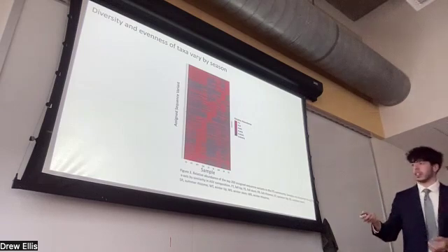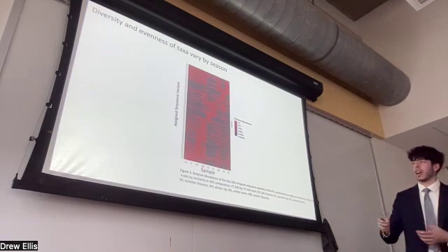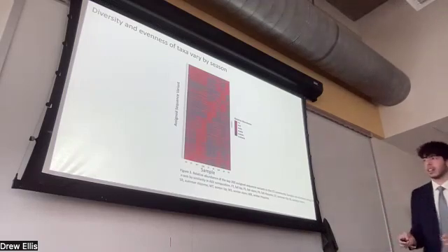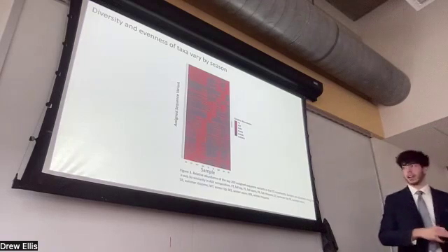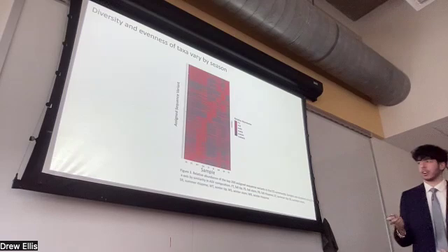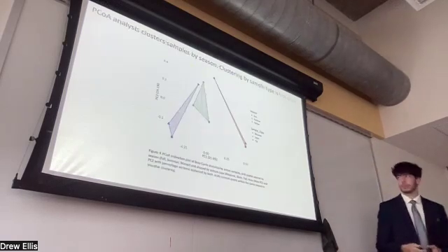But I wanted you to look at that and compare that specifically to the winter stem, which you see a lot more red across the board, across the column. I think you can maybe perceive that. Just kind of highlighting the fact that these species are represented at similar levels across the sample compared to the fall, just for a visual representation of what I'm talking about.